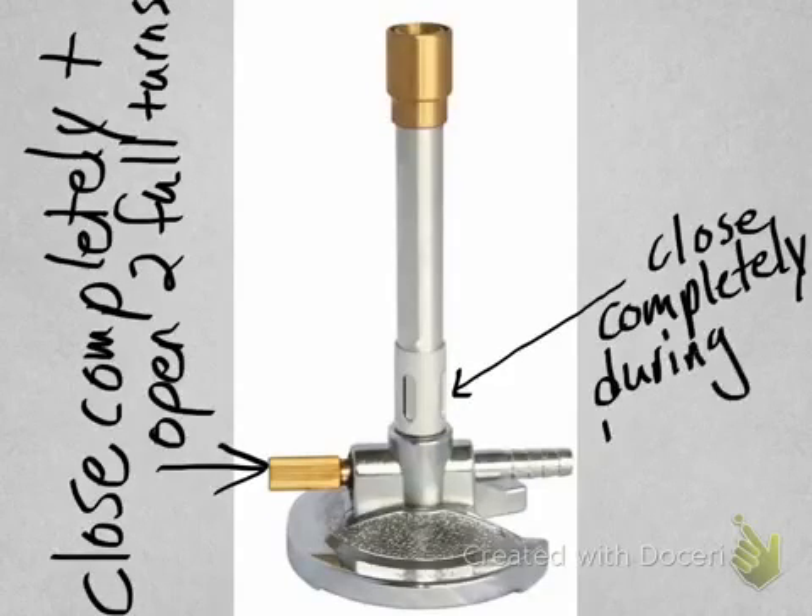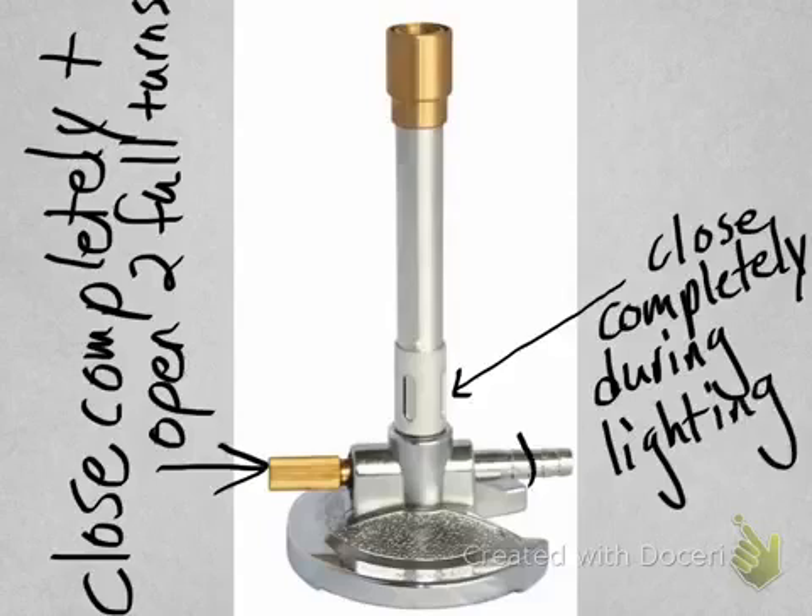The second step is to close the air inlet completely because during lighting we don't want any air coming in. Lastly, you need to place your hose onto the gas inlet of the burner and attach the other end of the hose to where the gas comes out in the classroom.